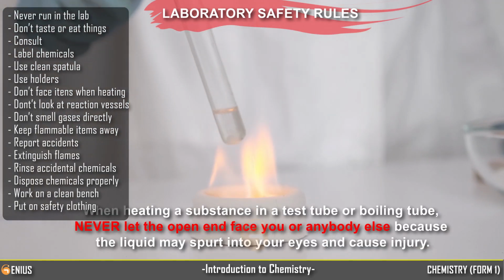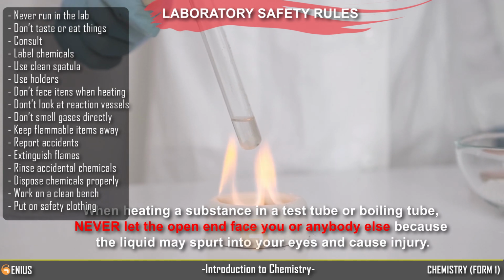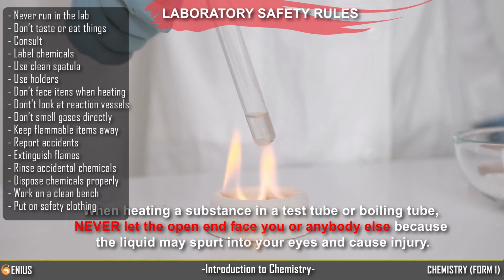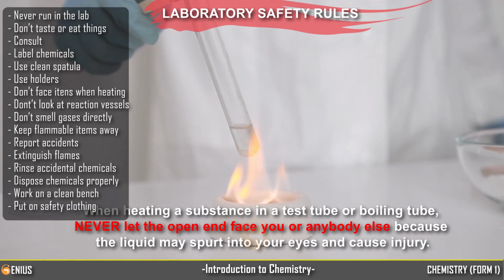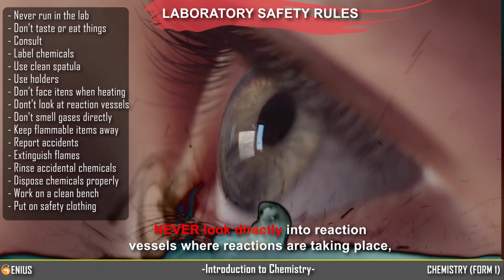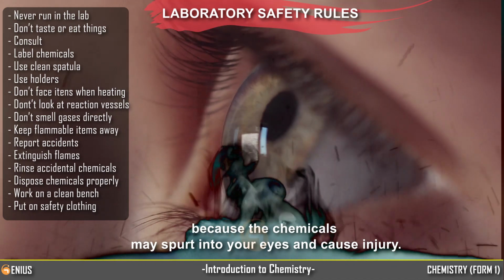When heating a substance in a test tube or boiling tube, never let the open end face you or anybody else because the liquid may spurt into your eyes and cause injury. Never look directly into reaction vessels where reactions are taking place, because the chemicals may spurt into your eyes and cause injury.